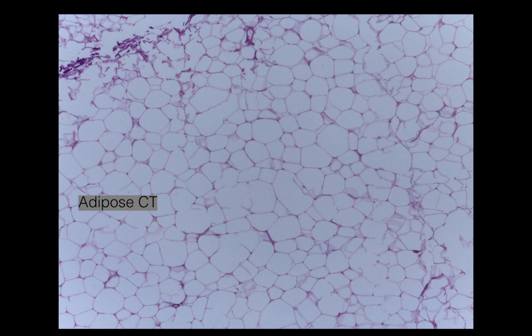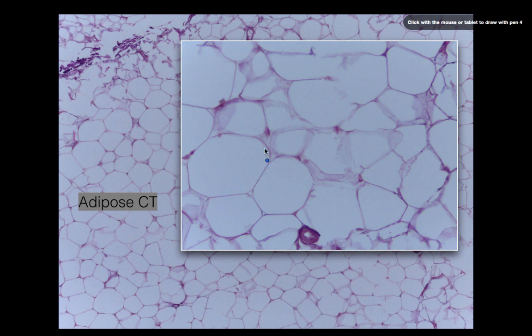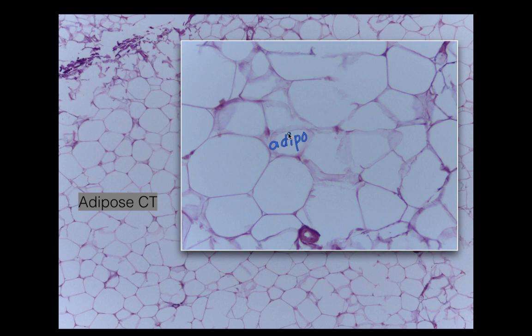Take a moment and see if you can identify this tissue. This is adipose connective tissue — it looks pretty much like a bunch of bubbles. Everything you see here is basically the plasma membrane of an adipocyte, which is a fat cell. It's going to have a nucleus that's pushed off to the side, and then all of this is plasma membrane — it's basically just filled with fat.